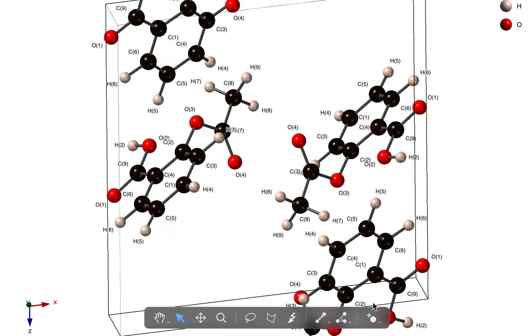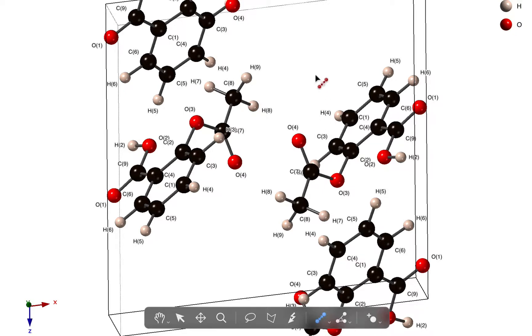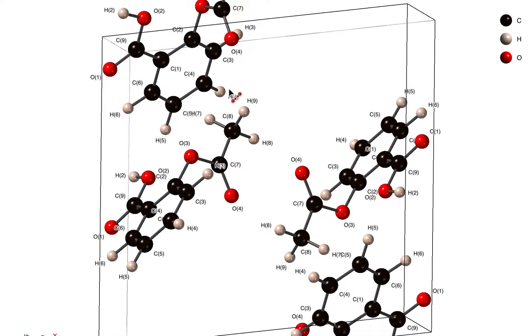Now we can measure distances in the plane of the plot using the screen distance tool, but it's not very easy to reposition the molecule to get that. So what we really want to be able to do is use our bond distance tool and add a dummy atom at the center of this C1 to C6 ring.